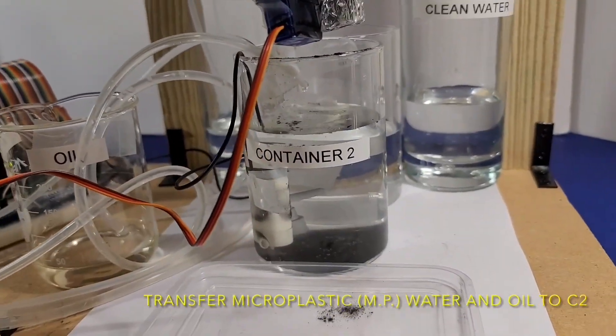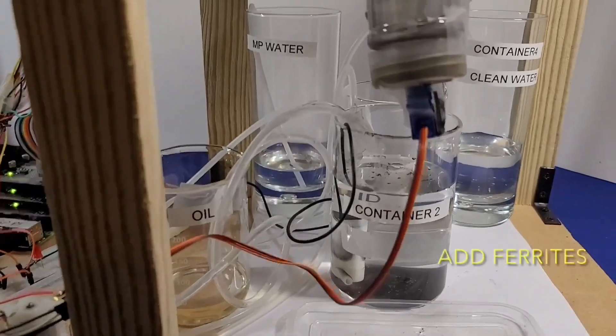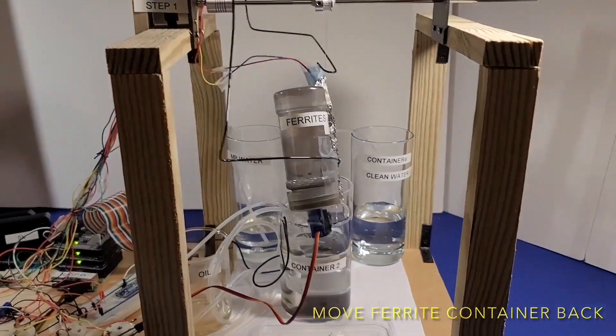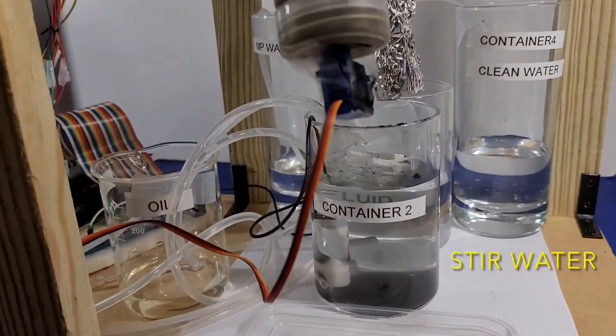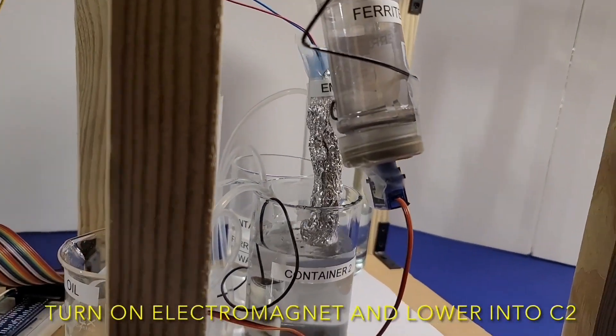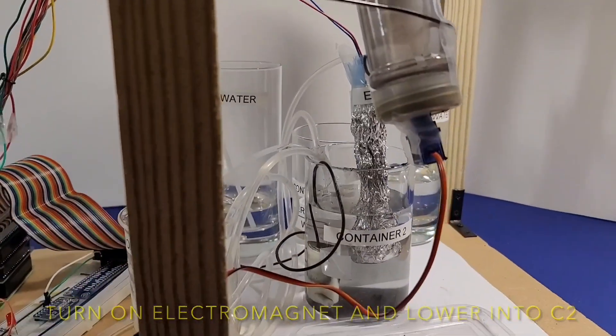Now I will show you my prototype in action. The microplastic water and oil has already been added to container 2. The ferrites are then added to the container and the stirrer turns on, which creates the ferrofluid as well as mixes the microplastics within the water.